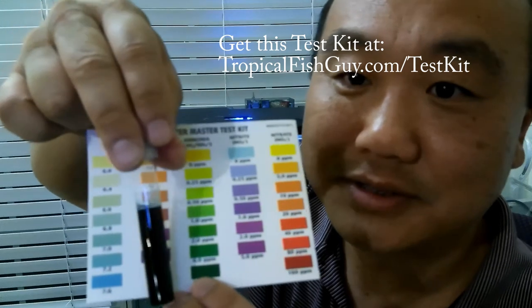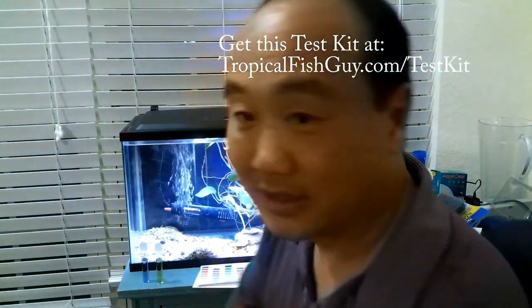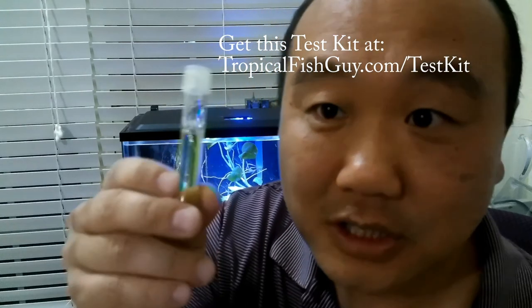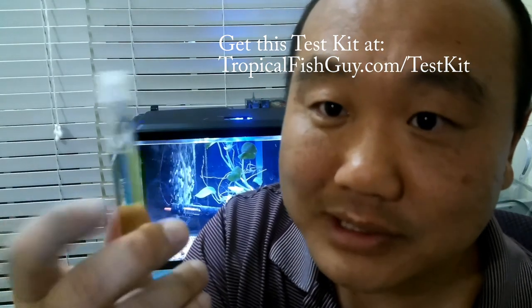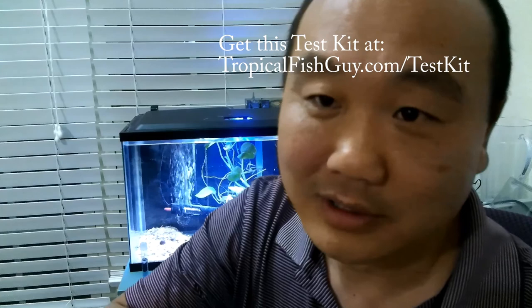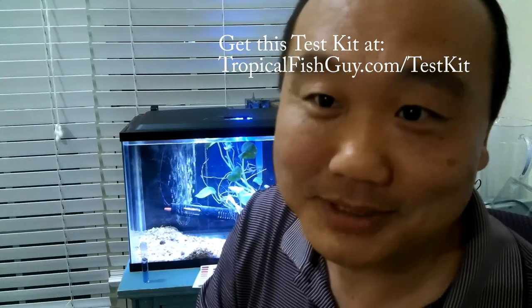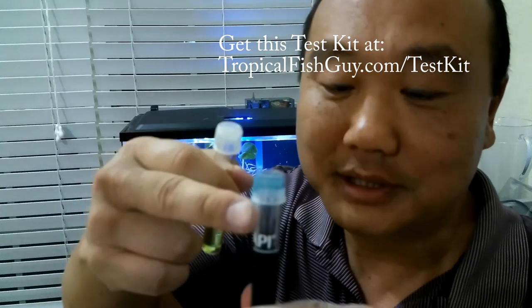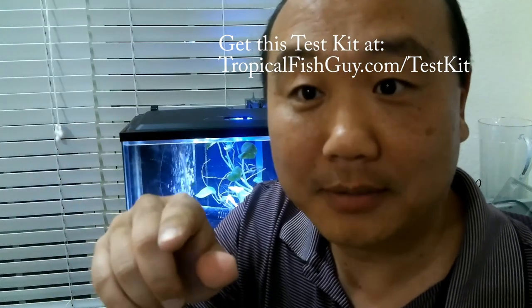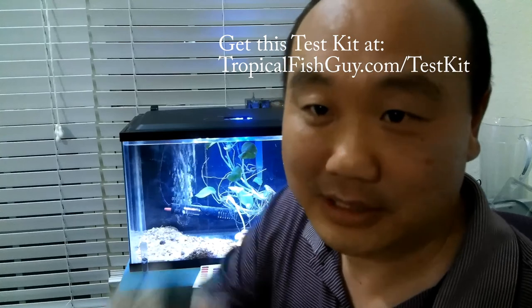So from this test: pH is low, nitrite is good, but ammonia is going to kill these fish. Here's the thing — ammonia is high and pH is low. If pH is really low, the nitrifying bacteria that consumes the ammonia cannot live. You're going to have to raise that pH. I messed up and didn't test the water before buying the fish. So I'm going to do a quick water change to lower the ammonia and add sodium bicarbonate — baking soda — to raise the pH, then retest.